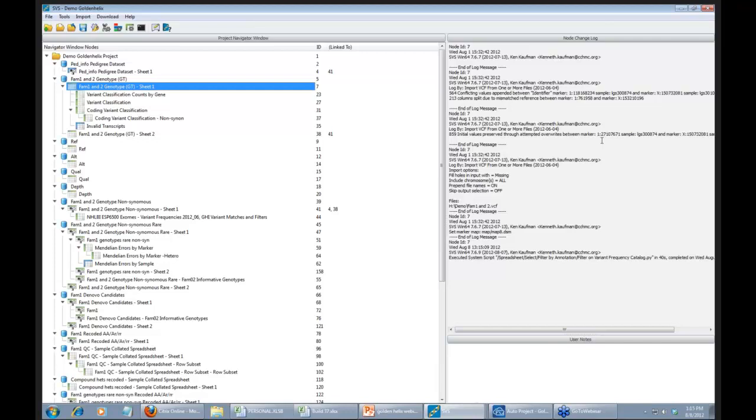Out of all of the de novo SNPs that we've found, which is probably somewhere on the order of 40 to 50, we've only found one de novo insertion deletion, and that was a 3 base pair insertion that we found in the child. So in our experience, insertion deletions are not very common in de novo variants, and they do cause a lot of false positives.